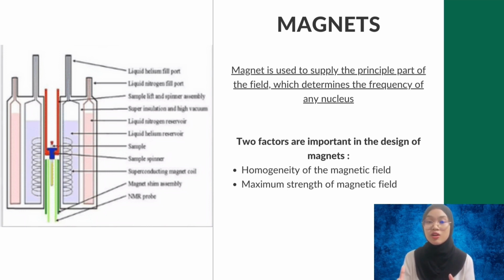Chemical shift can be defined as the difference between the resonant frequency of a spinning proton and the signal of a reference molecule. So, a machine with a large frequency range and large magnetic field gives signals that are less likely to overlap, which increases resolution to determine the molecular structure.